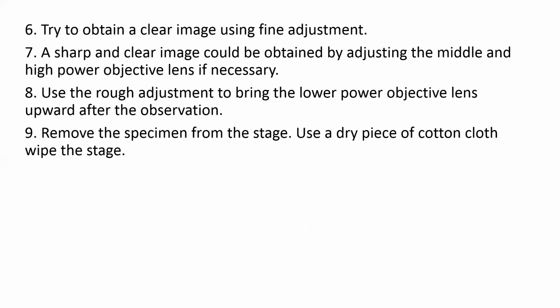Remove the specimen from the stage. Use a dry piece of cotton cloth. Wipe the stage.